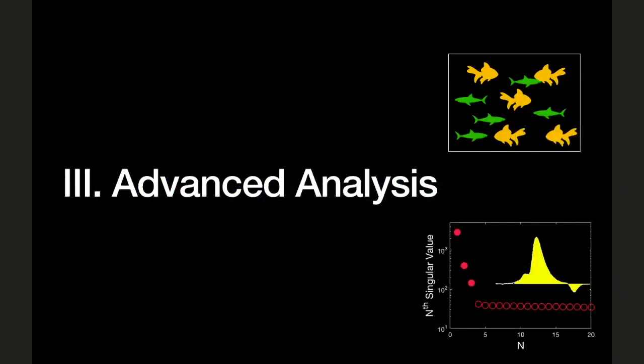Okay. But before I talk about advanced analysis, I'm going to introduce singular value decomposition. SVD is kind of the most basic mathematical technique that underpins all the other methods I'll talk about, so I'm going to spend some time on it.